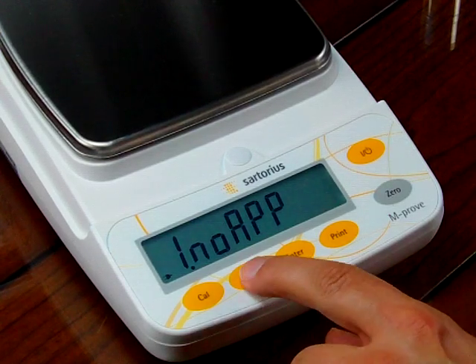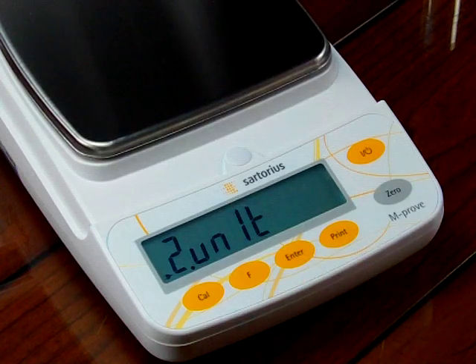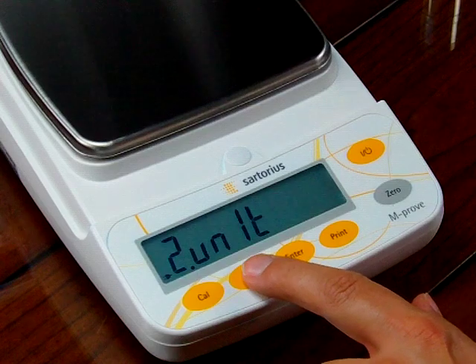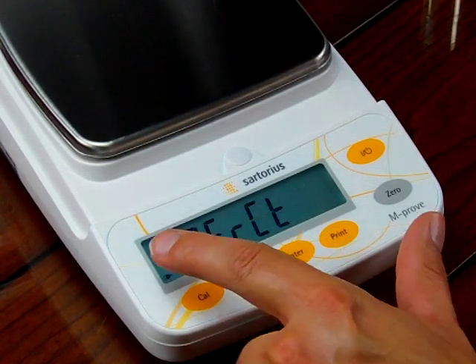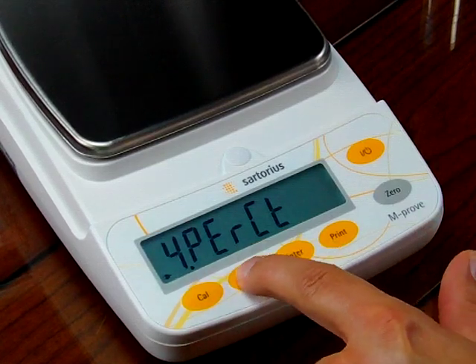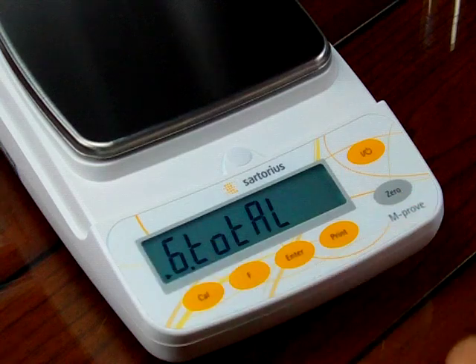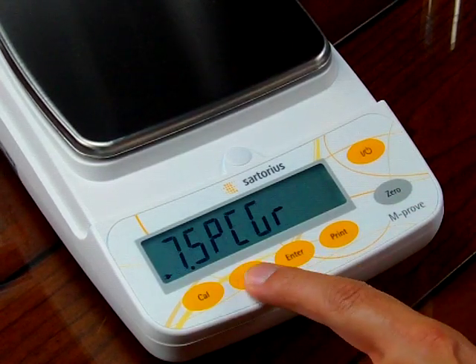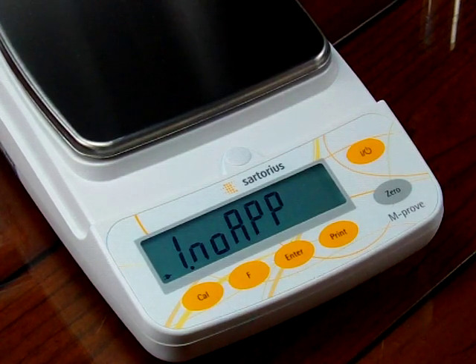If I press the F key, I have two, and this is unit mode. Pressing the F key again: three is count mode, four is percent mode, five is the hold function, six is the totalization function, seven is specific gravity. And then we're back to no application enabled.